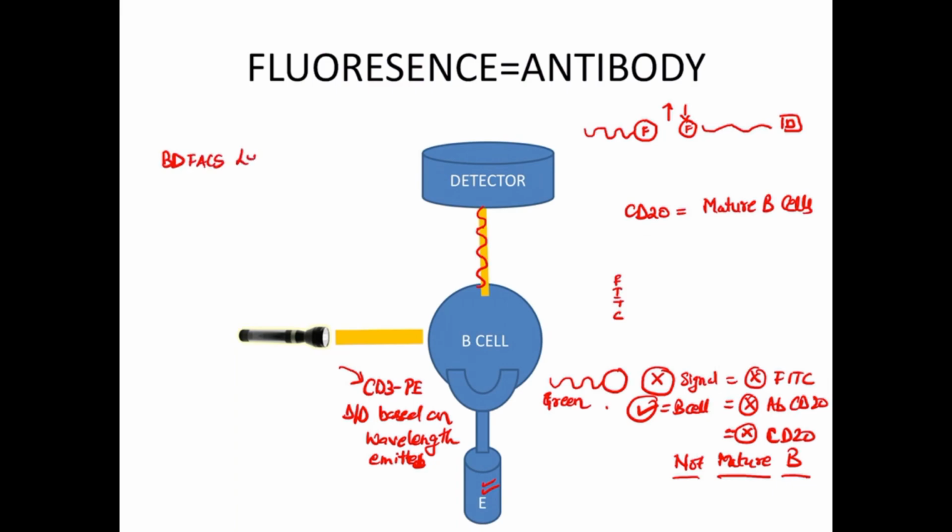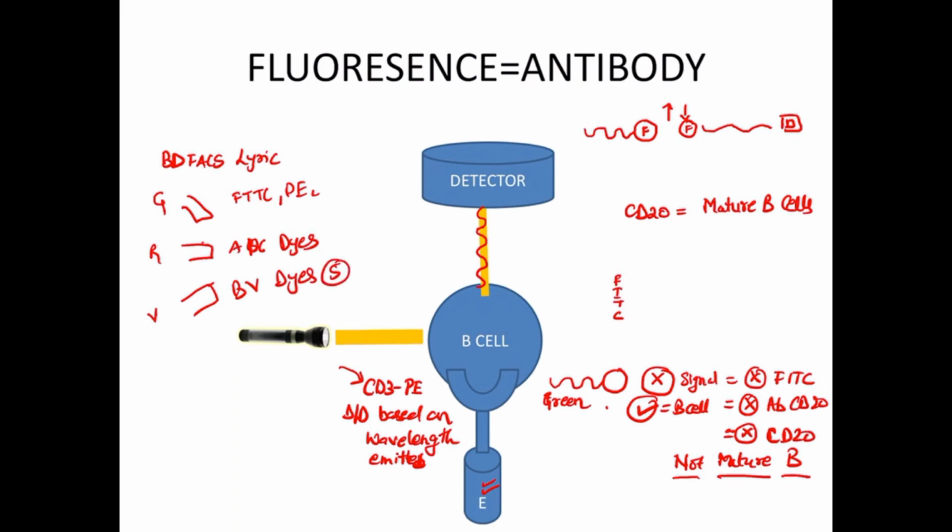This flow cytometer has 3 different lasers to excite 12 different fluorochromes. Within the green laser, the activation of FITC, PE, PE-Cy7 and PerCP takes place, while the red laser excites APC, APC-H7 and APC-R700 fluorochromes, while the violet laser in turn activates 5 different fluorochromes, which are BV421, BV510, BV605, BV711 and BV786.